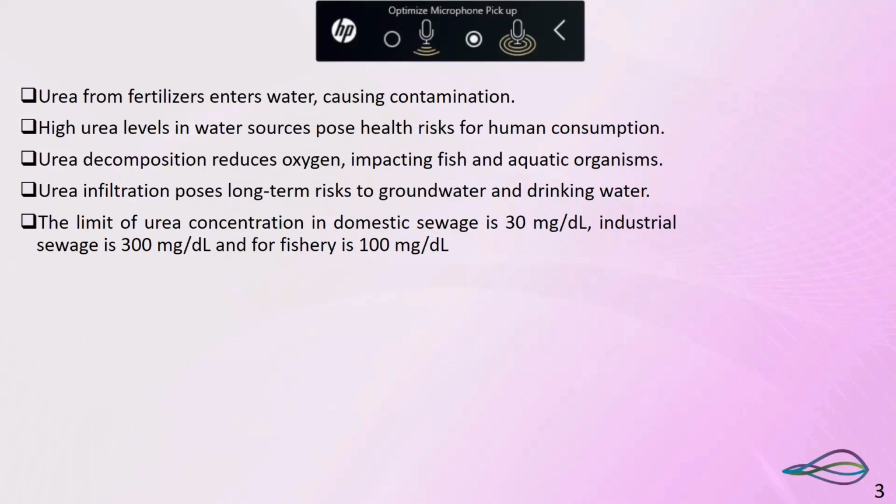So we need a meter. In the literature, there are spectrophotometry, colorimetry, and fluorometry techniques, which need costly instruments and also trained engineers or labor, and they are not portable in nature. So if we ask a farmer to buy an instrument of 50,000 or 10,000, it will not be feasible. So we have to make a portable and also economical instrument.